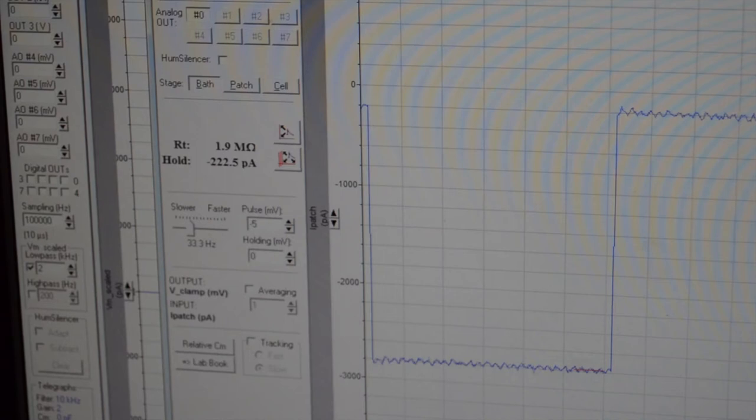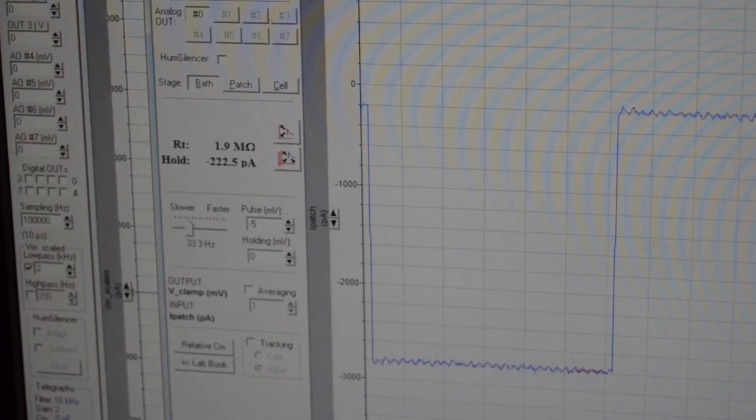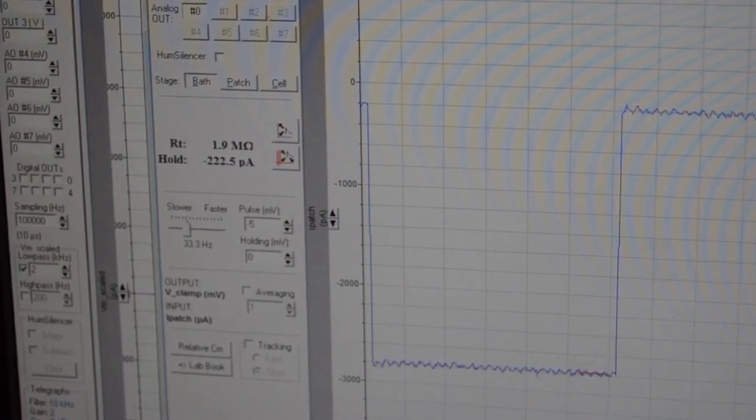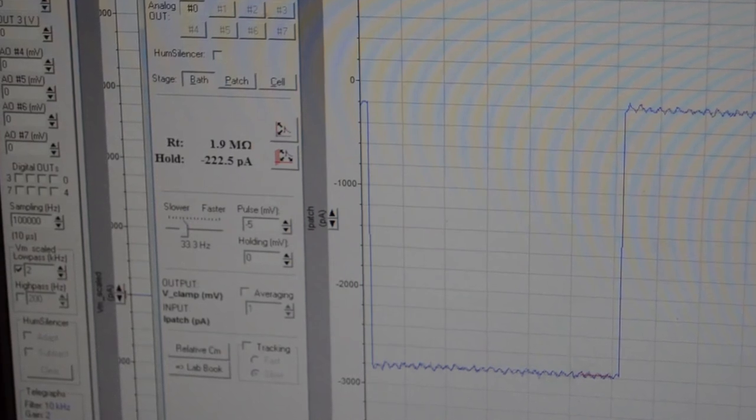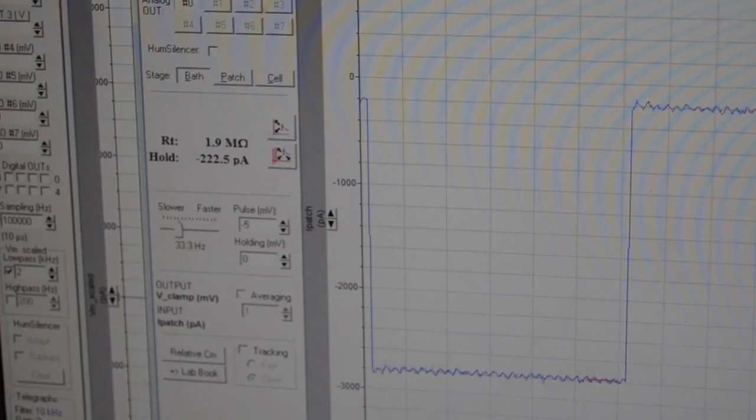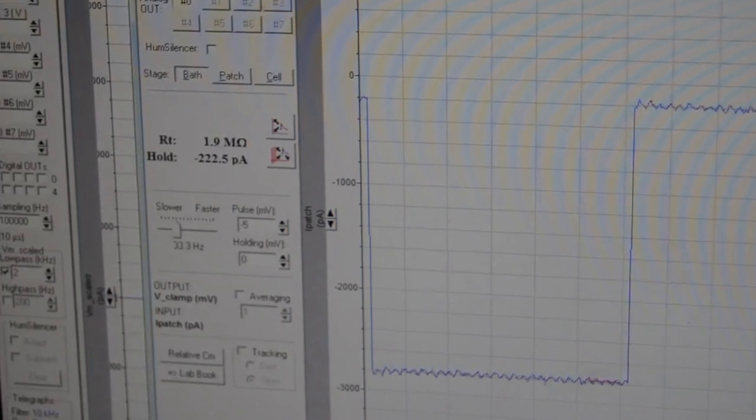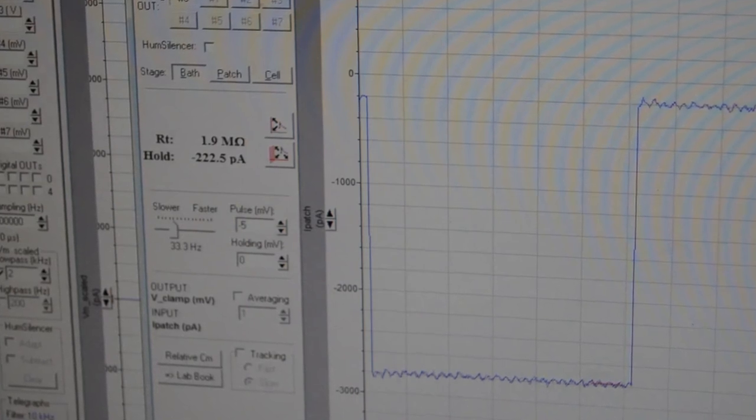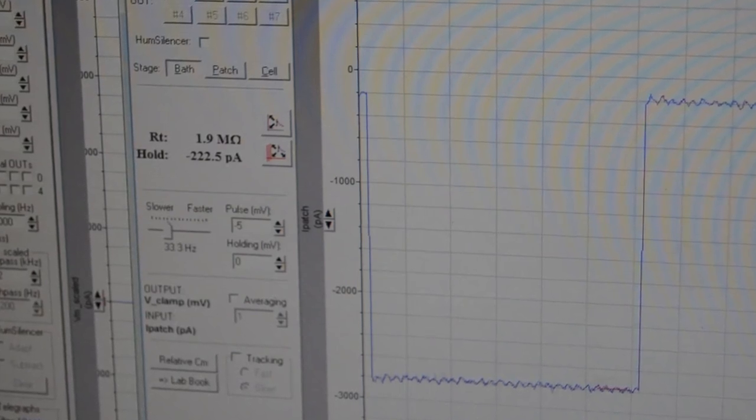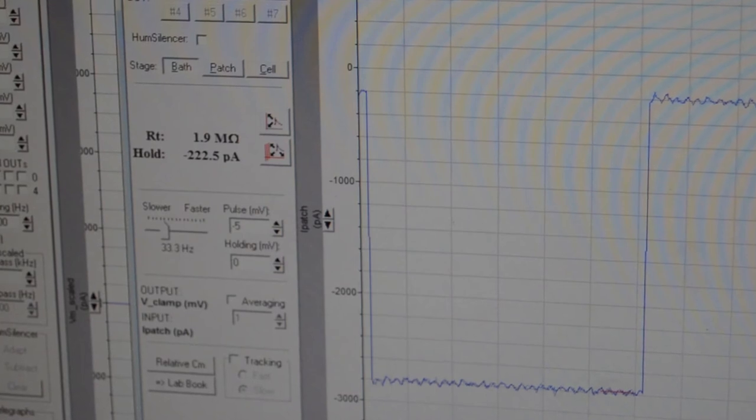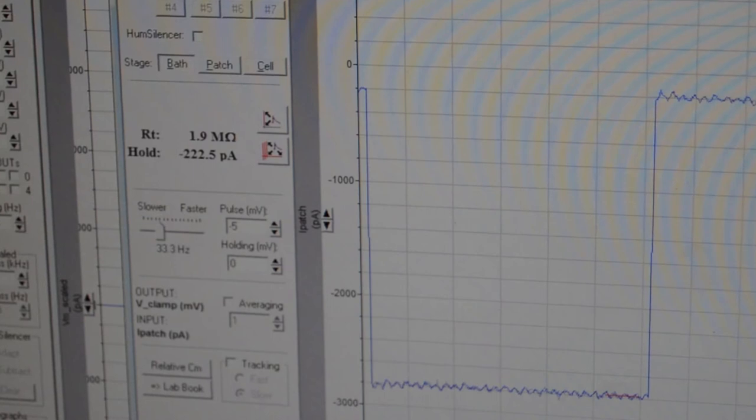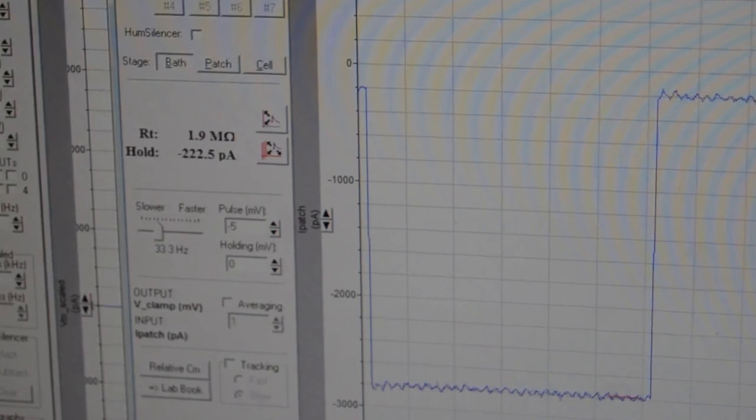What we see in this picture is an example of the tip resistance and current response when the glass recording pipette is in the bath solution prior to patching. We see a resistance of 1.9 mega-ohms and a large square current pulse. What might this suggest? Well, typically, for whole-cell patch clamp recordings, we actually want to use pipette tips with a resistance of 3 to 8 mega-ohms, as mentioned earlier. This means that we want our tips with a slightly smaller diameter, and this can be configured on the pipette pulling machine. With a higher tip resistance, less current can flow through the tip, and thus, a smaller current pulse will be noticed.